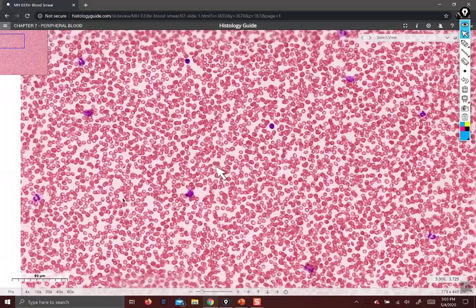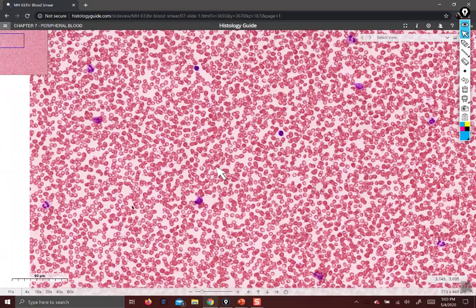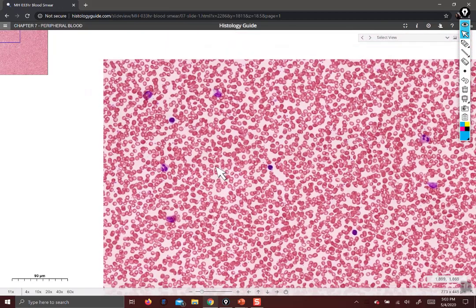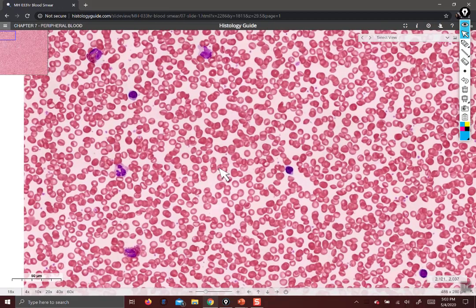I got another eosinophil over here. There's a lot going on in this corner: lymphocyte, neutrophil with pink granules and a multilobed nucleus, lymphocyte, eosinophil, another eosinophil. This is probably a large and smooshed lymphocyte — not an example I would use for a quiz because its morphology doesn't match well. It's damaged, and that's going to happen sometimes.